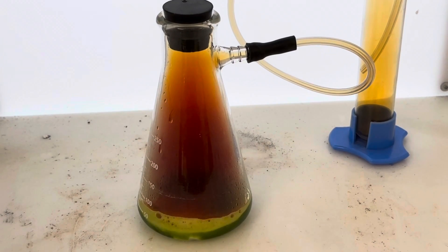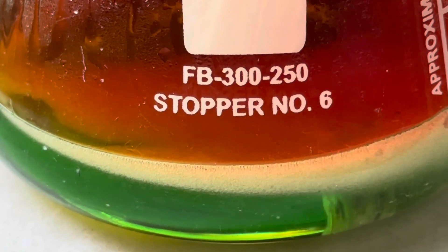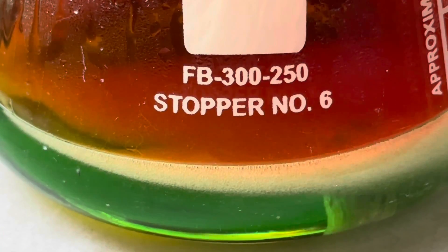I definitely see some nitrogen dioxide gas forming. What you're observing now is a redox reaction where bismuth is dissolving in the nitric acid and it's becoming bismuth 3 nitrate.